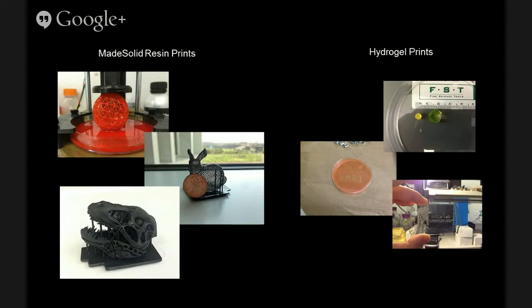That's possible. You have the scaffold, and then some sugar. That's the point of the glass method that they were talking about to build the vascular structures. They create the sugar space, they print the biomaterial around it, and then they wash the sugar out, and that leaves the vascular holes. So all these approaches, that scaffolding is something that's temporary.